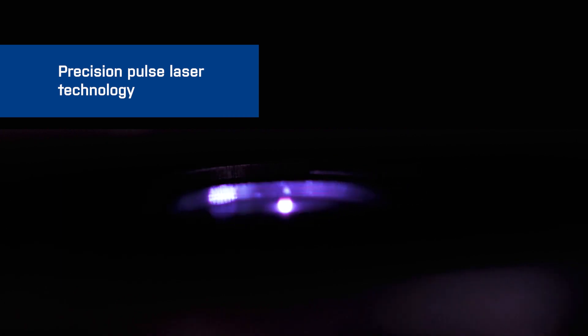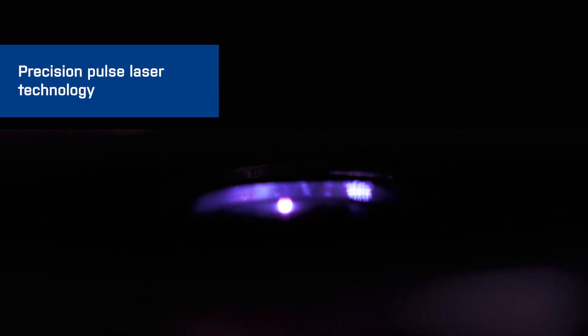6,000 laser pulses ionize the sample, breaking it down into plasma.